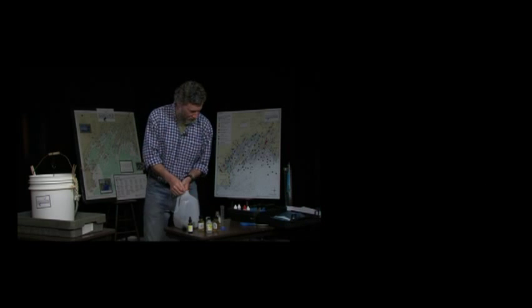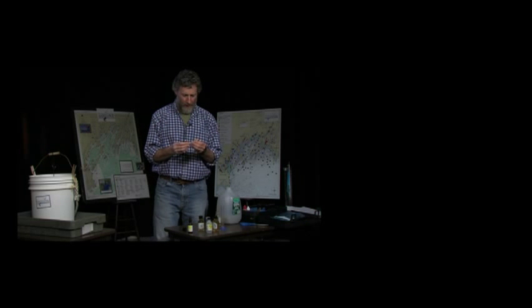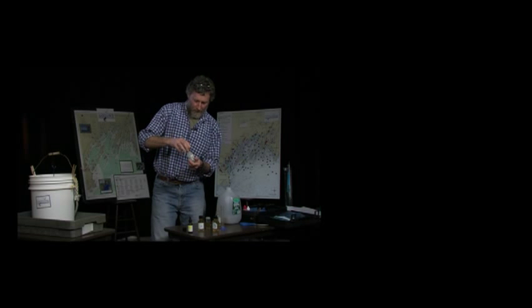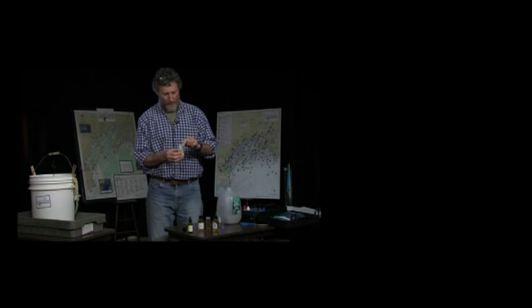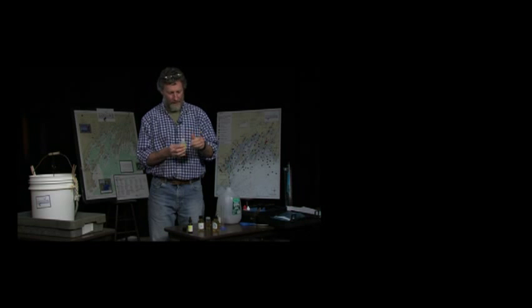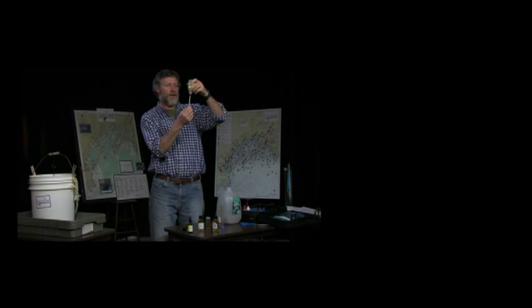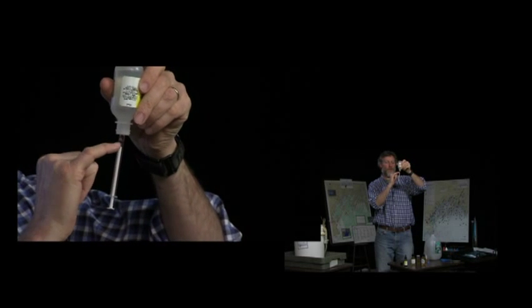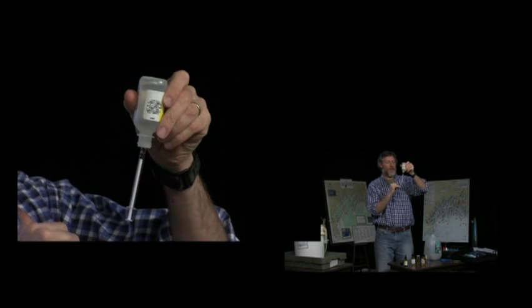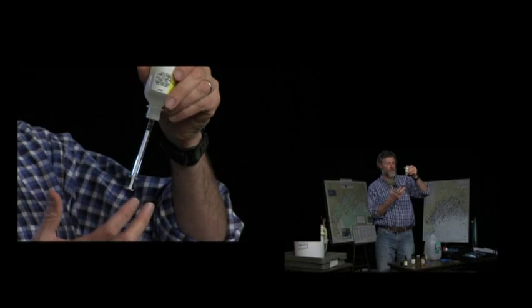The next thing that we're going to do is get our syringe or titrator ready. We're going to use this sodium thiosulfate bottle and take the syringe. In the top, there's a small plastic cap with a little hole in it, and we'll put that down into the bottle and turn it upside down. The first thing you notice is there's an air bubble that usually forms on the top of this syringe. Typically that happens the first time because it's all dry and hasn't been used, so it's not wet inside. We want to get rid of those air bubbles.